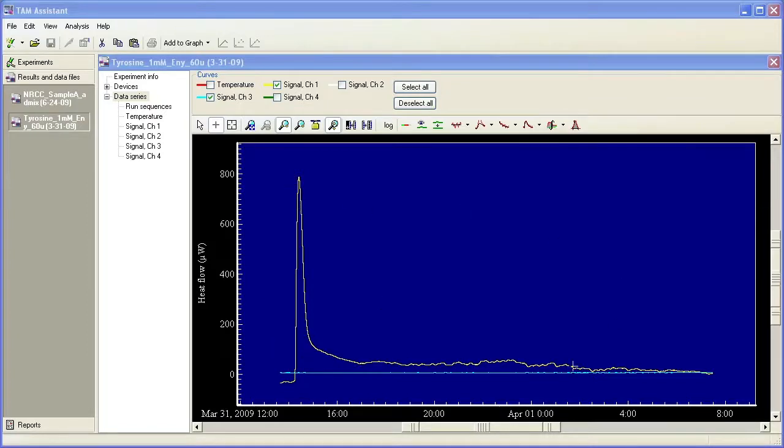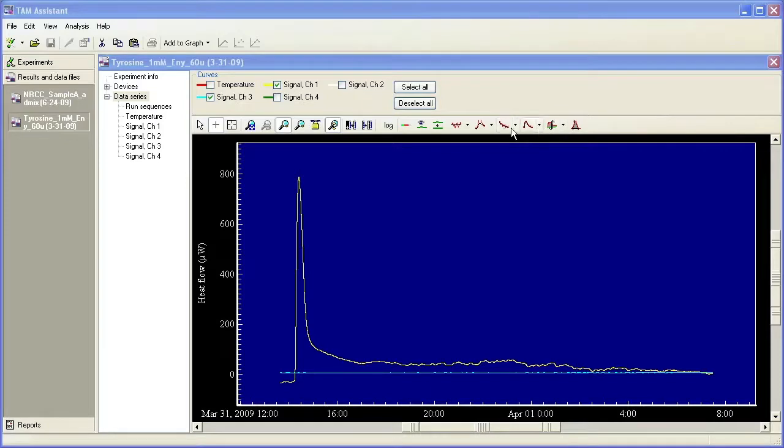Right now we just have the results open, and you can perform integrations or curve fitting procedures in the results file, but you won't be able to save the data.